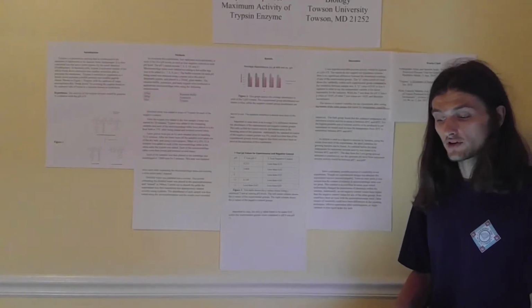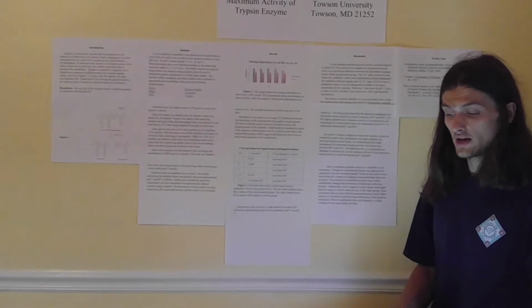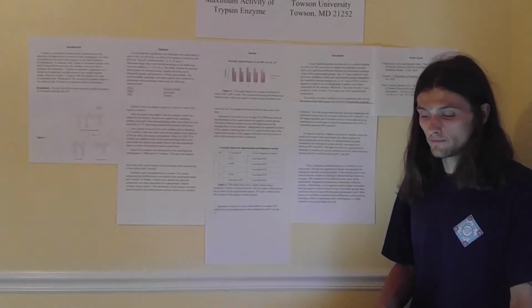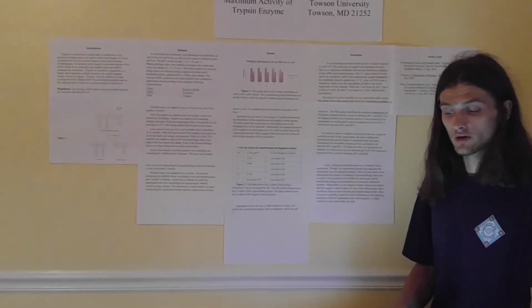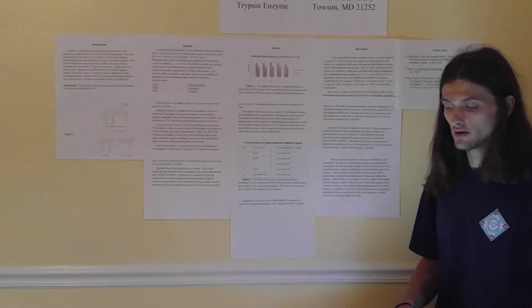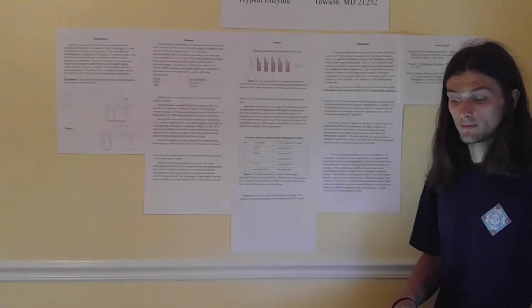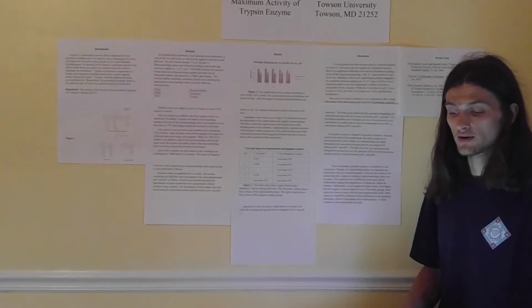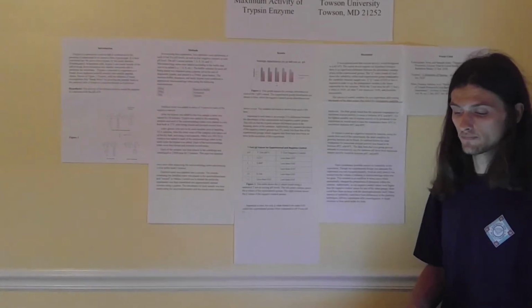The choice of control variables for our experiment, after seeing the results of other groups that tested for temperature, could be improved. The PART group found the optimum temperature for maximum enzyme activity to occur is between 48 degrees Celsius and 68 degrees Celsius. For the highest possible rate of enzyme activity to be produced in our experiment, we would need to raise the temperature from 38 degrees Celsius to somewhere between 48 degrees and 68 degrees Celsius.